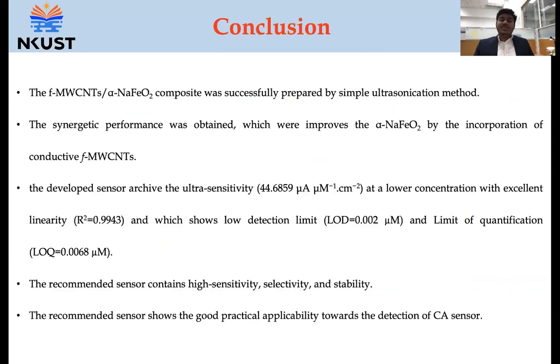In conclusion, our proposed sensor was successfully prepared by a simple ultrasonication method, and this synergetic effect improves the incorporation of conductive functionalized multi-wall carbon nanotube and sodium ferrite. The developed sensor achieves ultra sensitivity at lower concentration levels, and our electrocatalyst achieves low LOD and low LOQ. The recommended sensor also has high sensitivity, selectivity, and stability. Finally, it shows good practical ability towards the detection of caffeic acid.